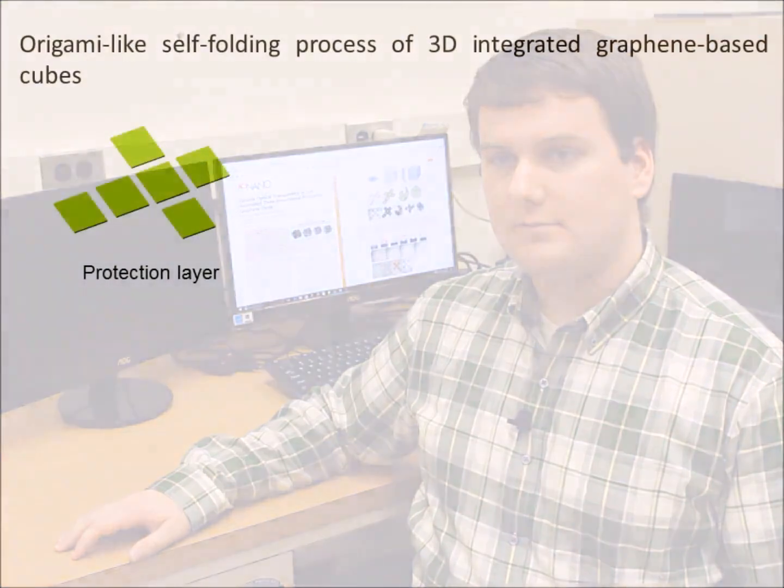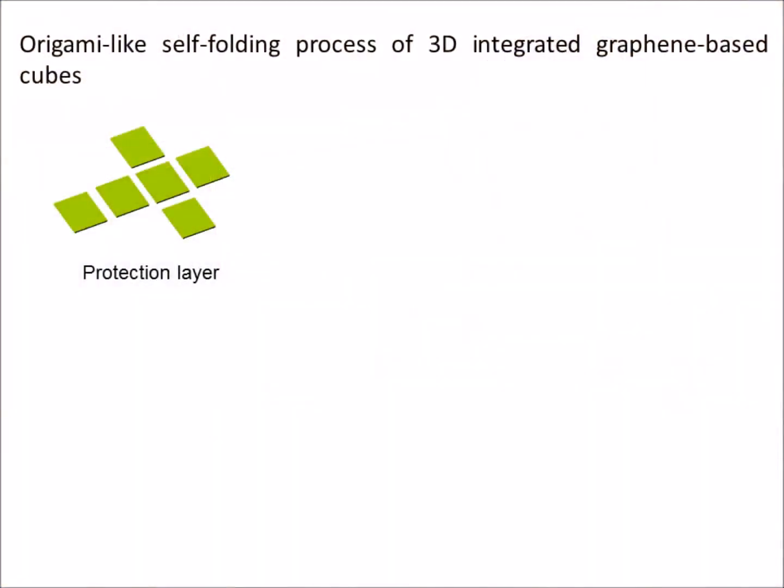A number of chemical routes for the production of 3D graphene-based structures have been introduced. However, these methods typically require strong chemical reactions which affect the intrinsic properties of the graphene and present challenges in the construction of freestanding, hollow 3D graphene polyhedrons. To overcome these limitations, this study shows a methodology for realizing multi-faced 3D microcubes with 2D graphene and graphene oxide by using origami-like self-folding.